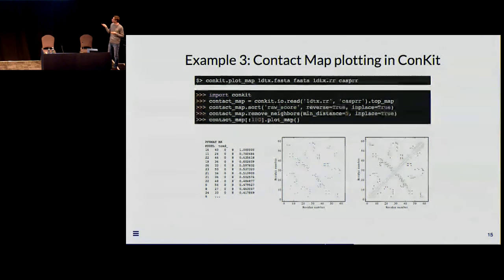And what this script will do for you is it will color all true positive or correctly predicted contacts in green and all false positive contacts in red. And it will also show you all the contacts it extracted from your reference structure, so you know where you would expect the contact to be.